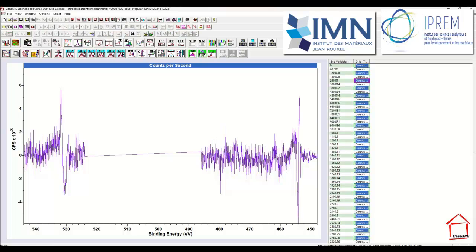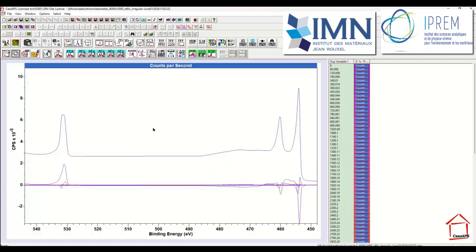Now I saw a large number here, large in terms of what I can manage myself, of abstract factors that I might want to try and use to analyze these data. Too many: four, five. We're talking five dimensions in which we're working, and I would rather work in two dimensions.